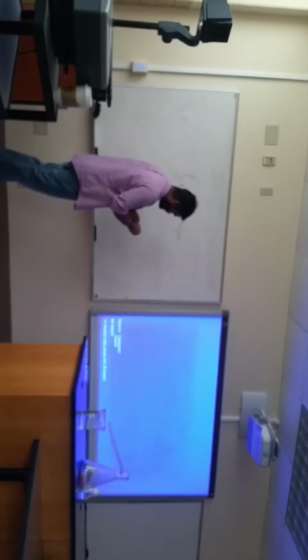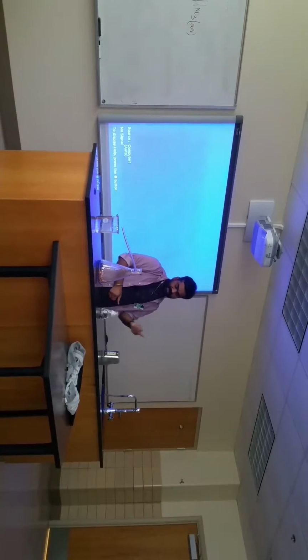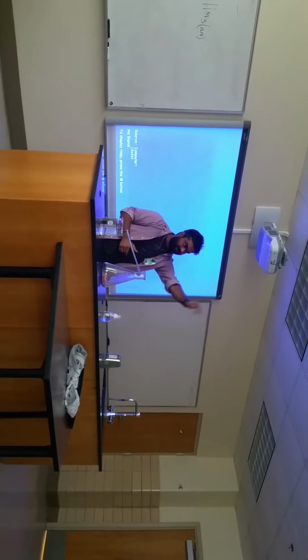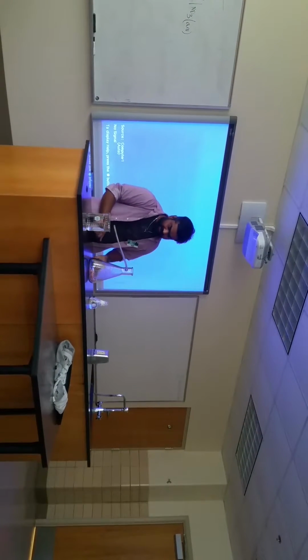Nitric acid is extremely dangerous, extremely corrosive. If it accidentally falls on my skin, for the first few seconds, nothing happens. After 10 seconds, you can see a hole in my hand. It's pretty bad stuff. Extremely dangerous, extremely corrosive. You won't be able to get this in stores. So I have solid copper.